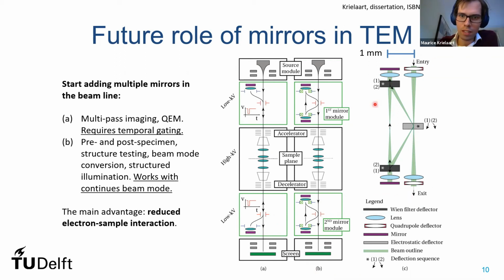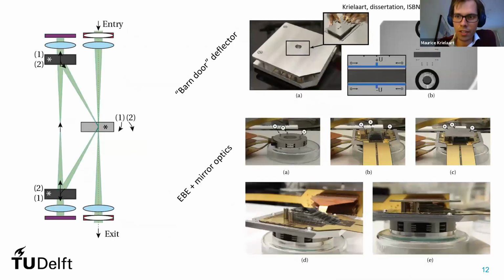Specifically, this setup, and that's why I focused on it, is what we're currently trying to get to work also inside a scanning electron microscope as a prototype device. And just to give you some more visuals, some photographs: here's again the schematic.